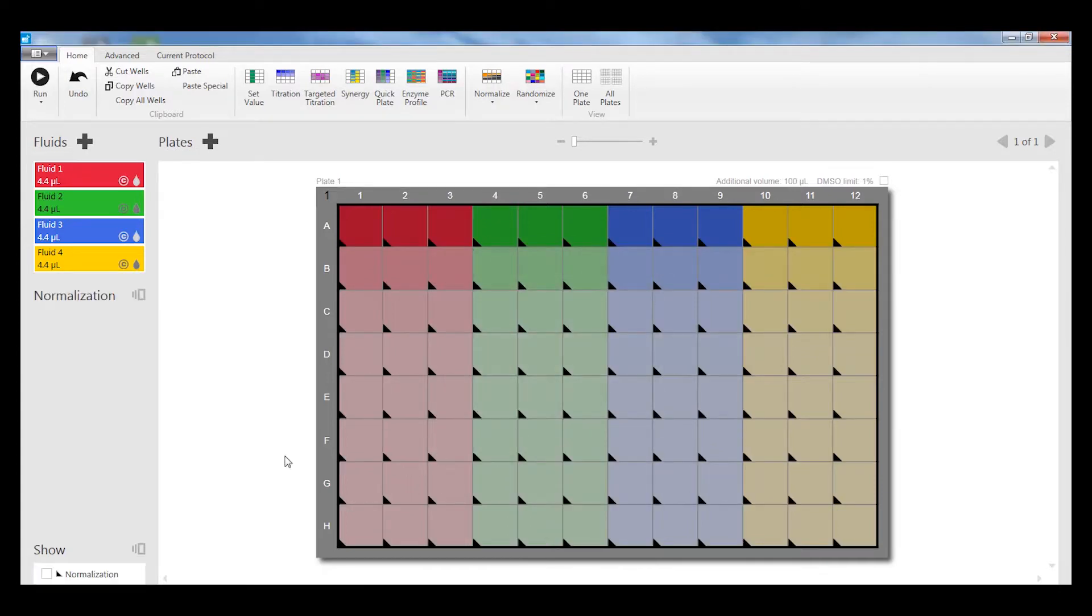This will add DMSO to the wells that need it to normalize the DMSO concentration that's shown by the black triangles.